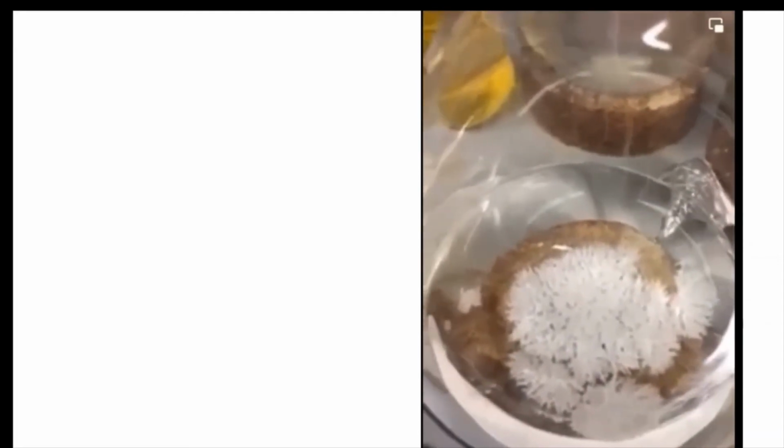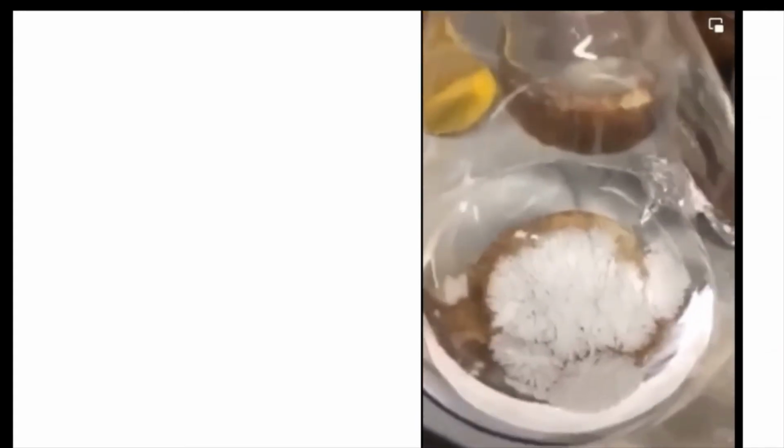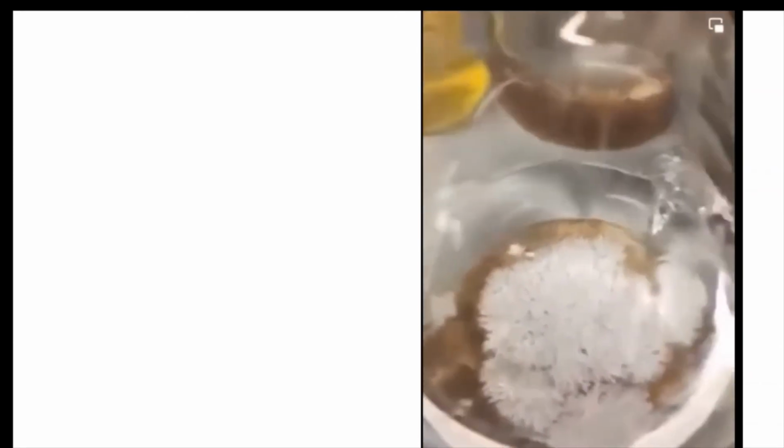If you have a polar group like alcohol, solid amine or amide, or solid ester, I know all esters are normally liquid, but there are some esters that are solid. So try hexane or heptane or pentane or cyclohexane to do the recrystallization. Many aromatic ring containing compounds in dichloroethane also give good crystals. Sometimes in toluene you can also get crystals.